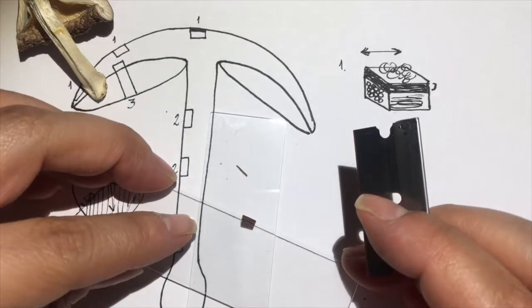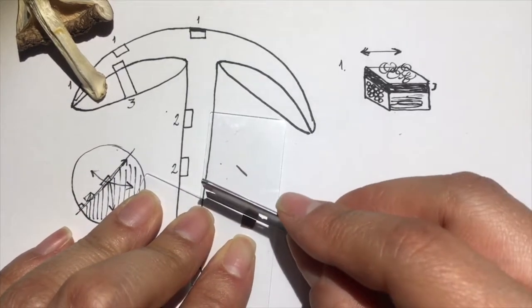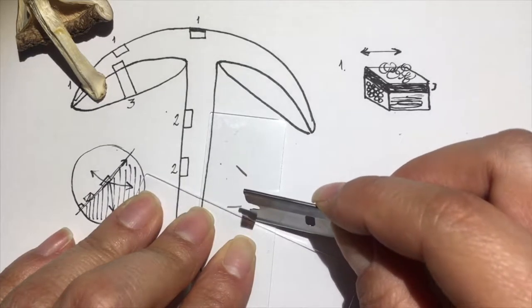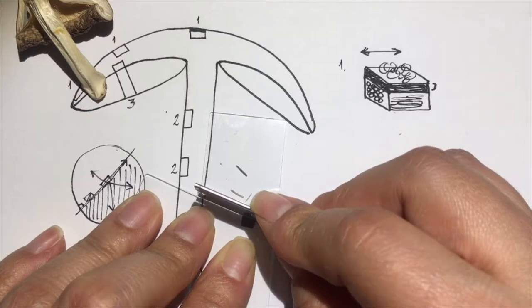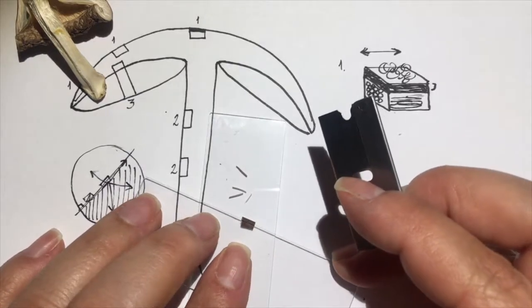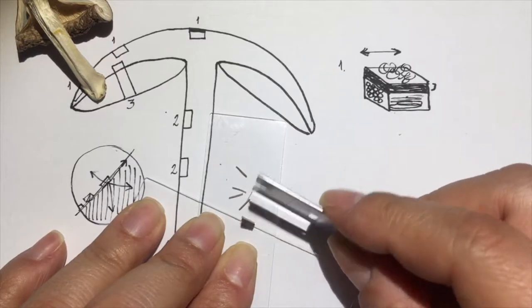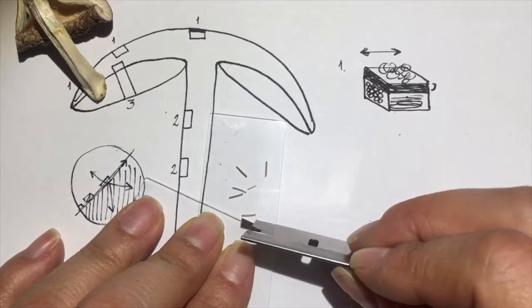So now that I have that, I'm actually going to move the glass a little bit closer because I don't want to give myself too much space with the blade. This restricts the space that I have. I don't like to use a blade too much. See, this one I like. This one seems thinner. But I'll show you in alcohol what happens and how you can tell which sections are good, which sections are not good.